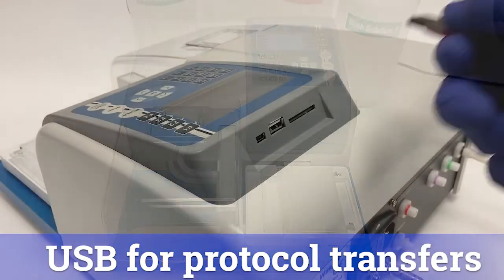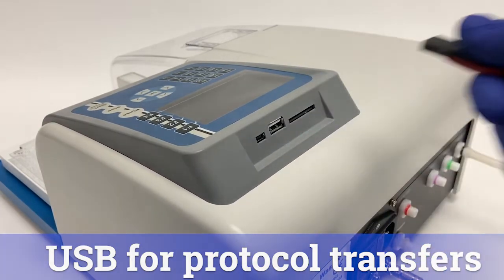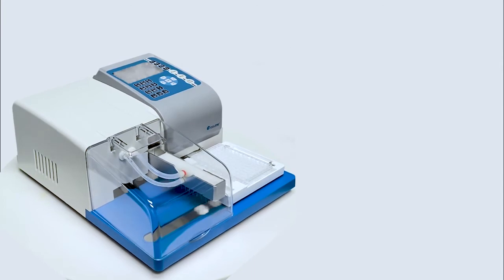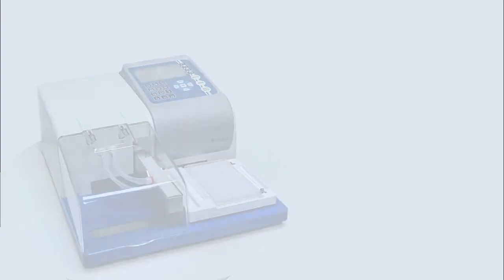The instrument also has a USB port for transferring wash protocols between instruments using a flash drive. The SmartWasher 96 is a well-rounded and easy-to-use microplate washer. With flexibility in wash parameters and intuitive software, the instrument will be a welcome addition to any lab processing ELISA assays.